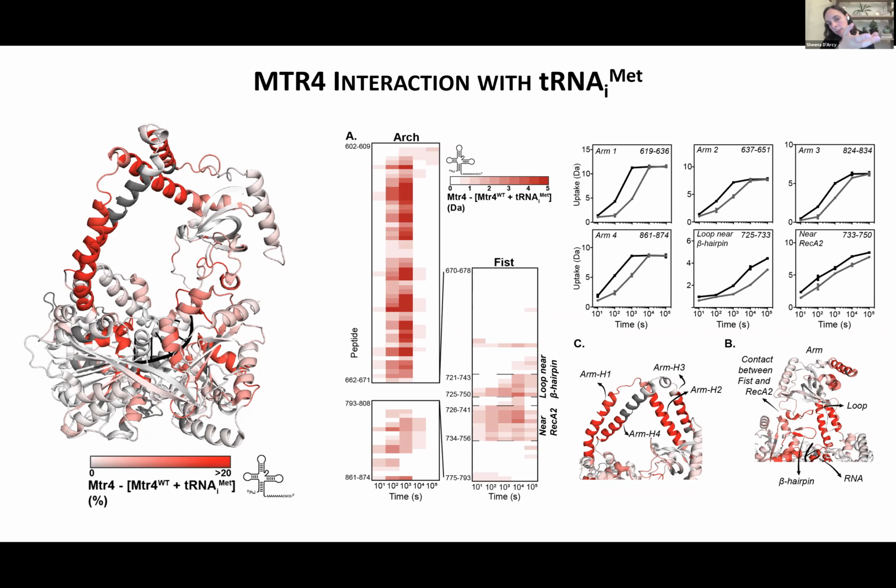And the second thing, and maybe the person that asked the question would be interested, we've done some work on an enzyme called kynureninase. What's been novel about our HDX experiments here is that we've done them under steady state conditions. In other words, we're doing the HDX during turnover, and we're very careful about how much substrate we add and the time points. Our goal was to see if we could identify not only binding of the substrate, but changes due to turnover of that substrate. We've had some very interesting results where we have seen the enzyme active sites completely unfold, but this hasn't caused any problems in our experiments. Excellent. Thanks for that extra insight.